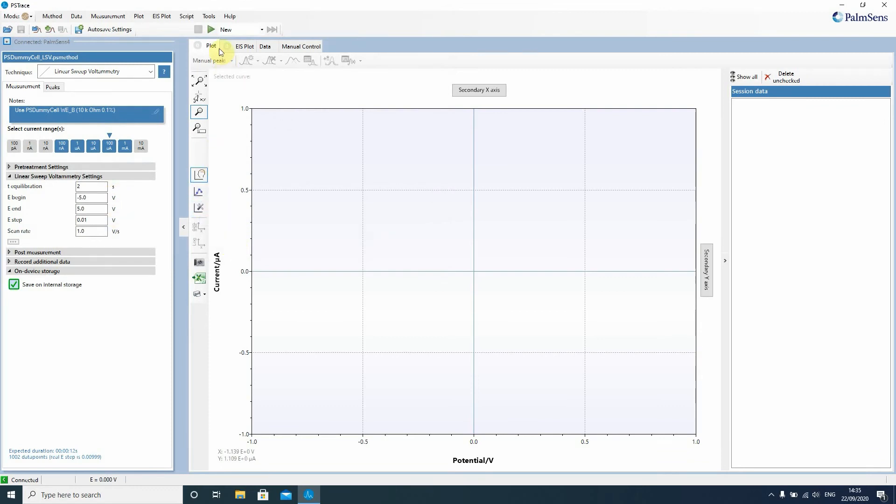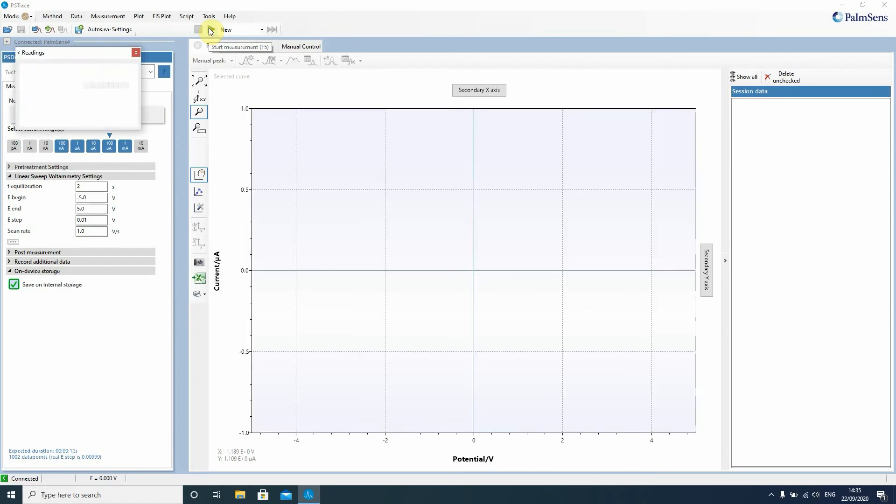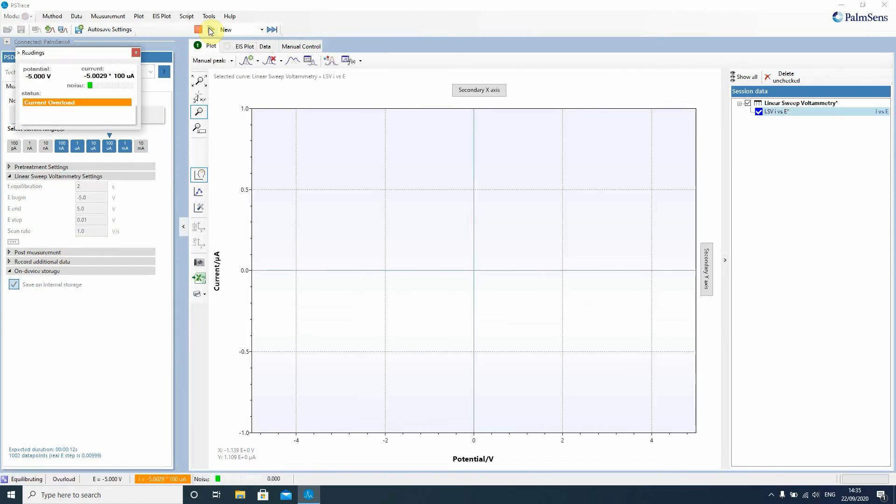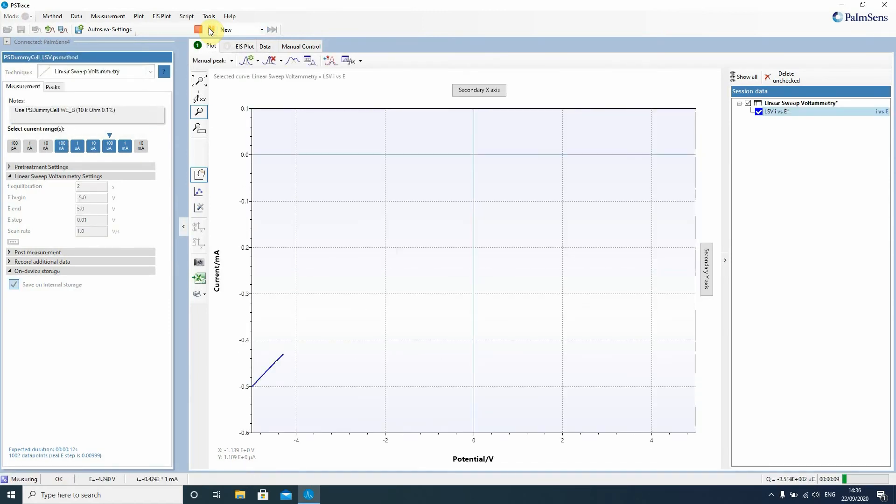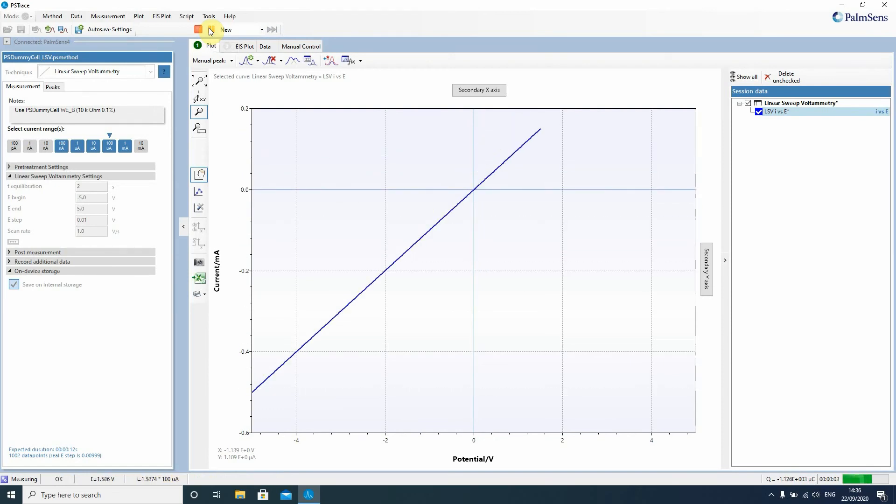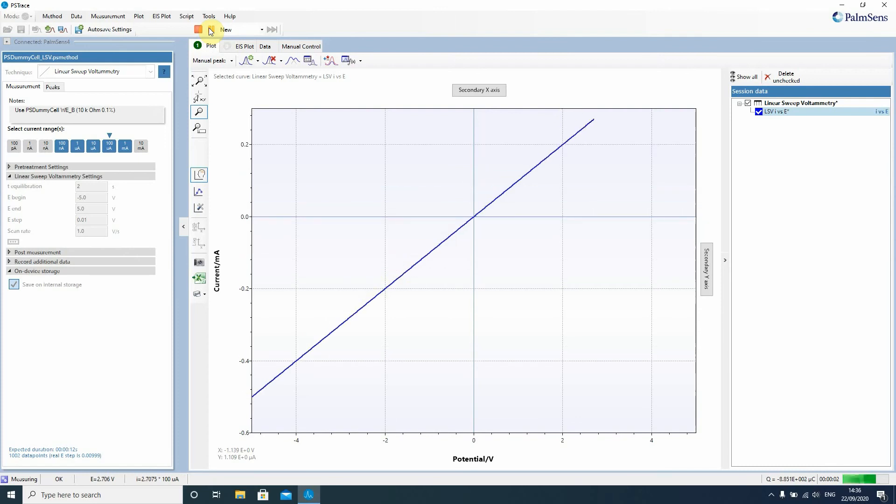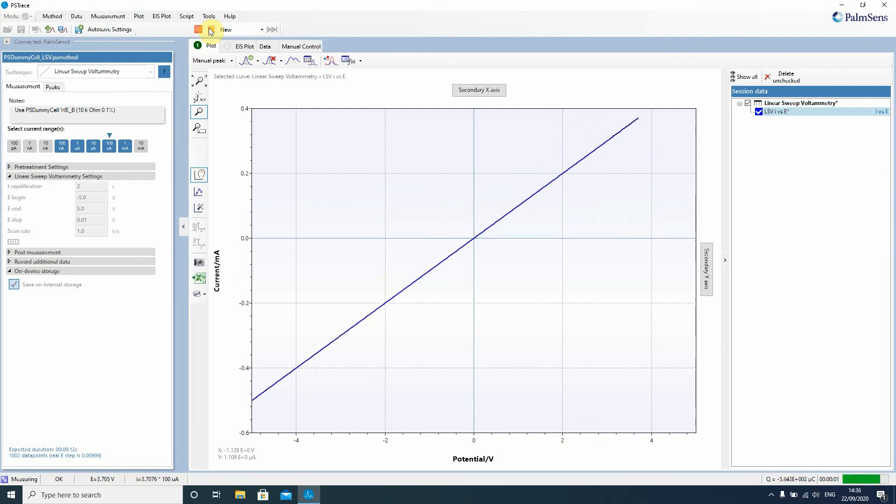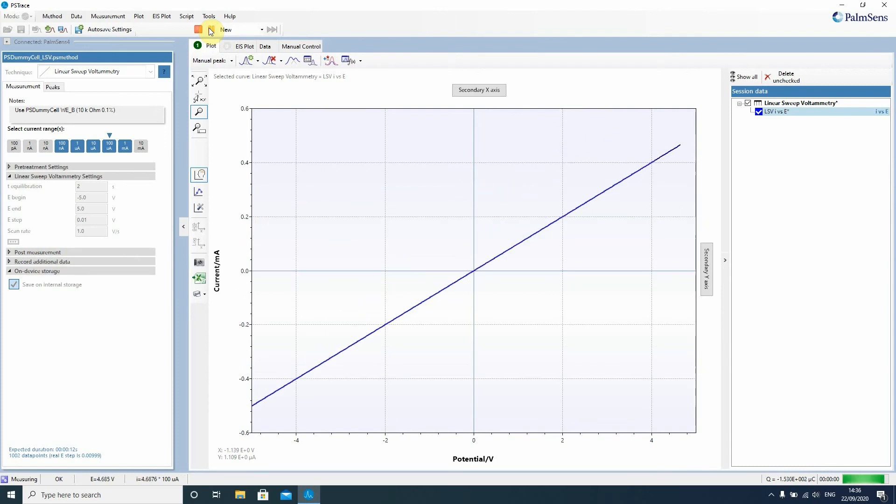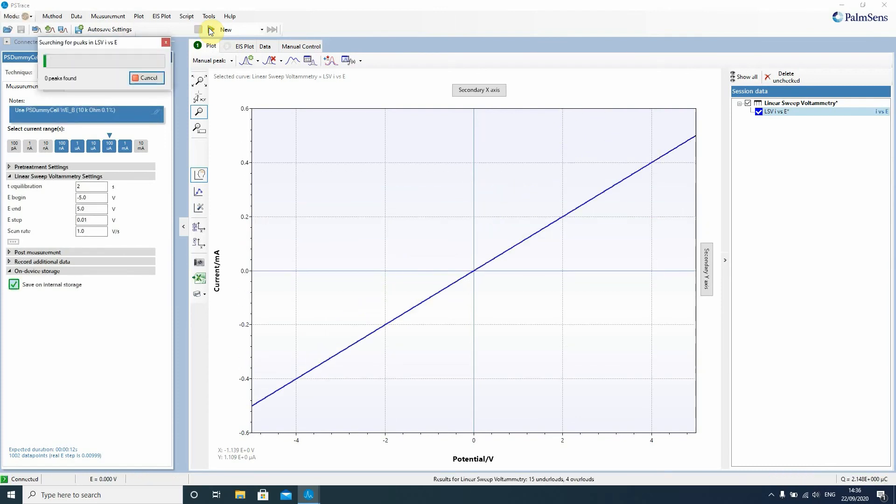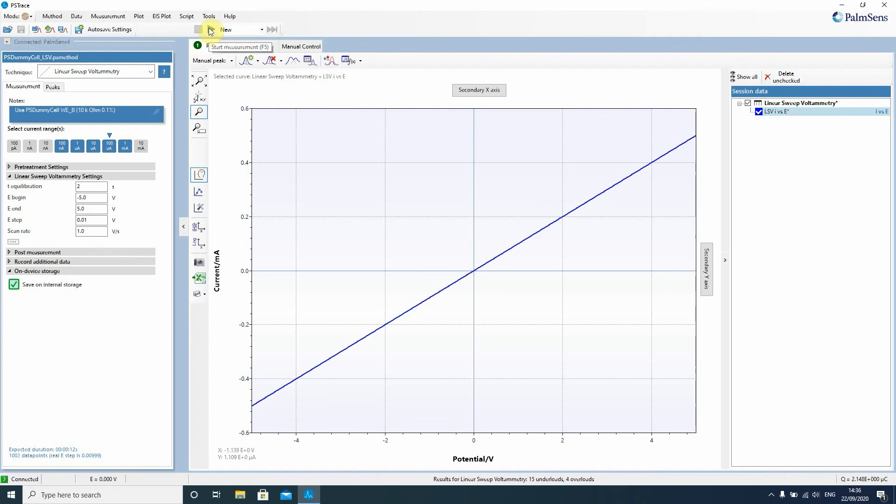Then you just need to press the run button and it starts to do the first measurement. You see live how the values are recorded on the screen of the Palm Sense 4. You see that it's running a linear sweep voltammetry and then it's done and you have already performed your first measurement.